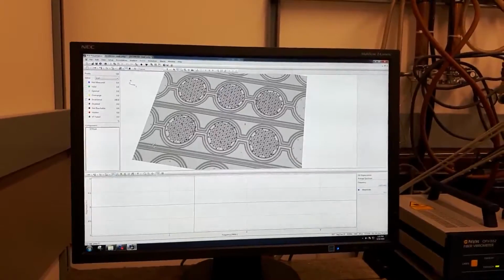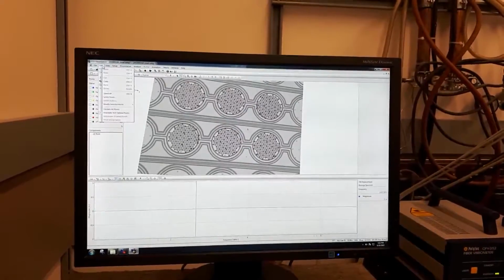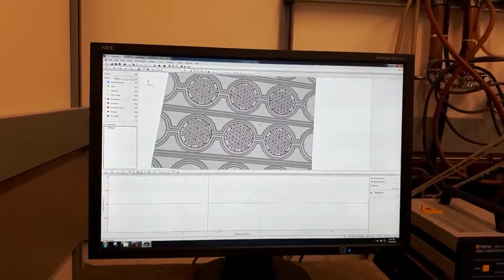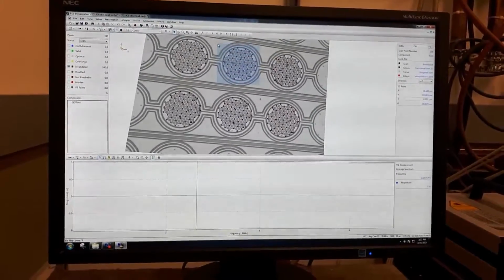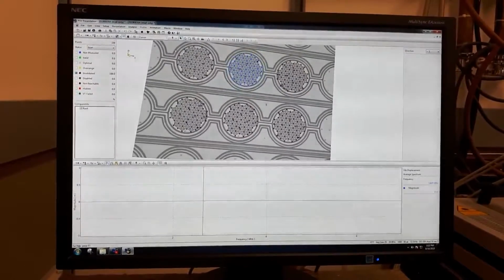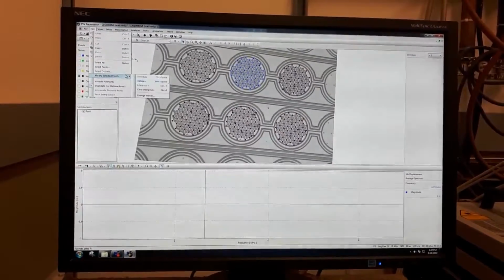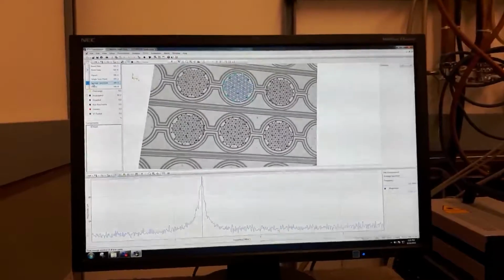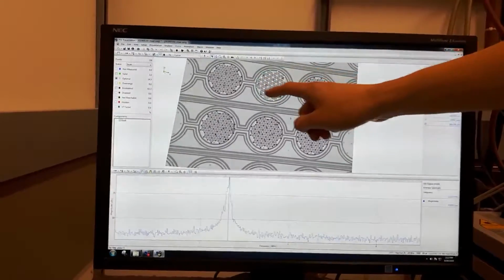Then if you want to extract the measurement of just one of them, you select a point. As far as I remember, you move the cursor, and holding Shift it allows you to draw them. In modify selected point, you only validate them, and there we go. Now what you are looking at is only the measurement of the single membrane.